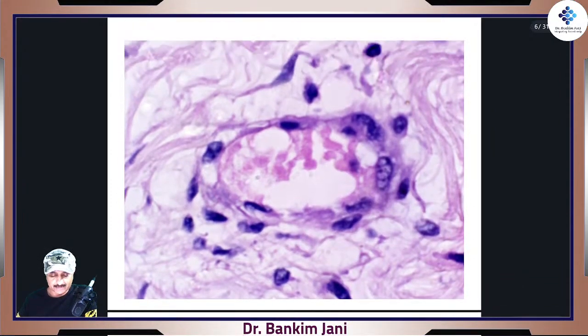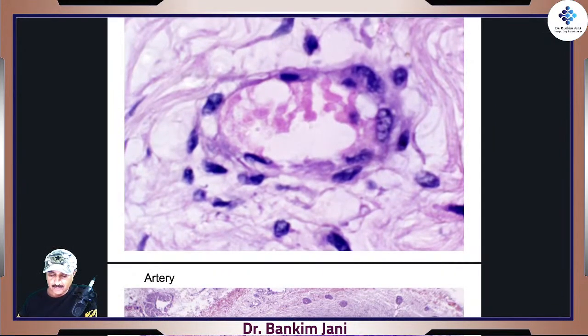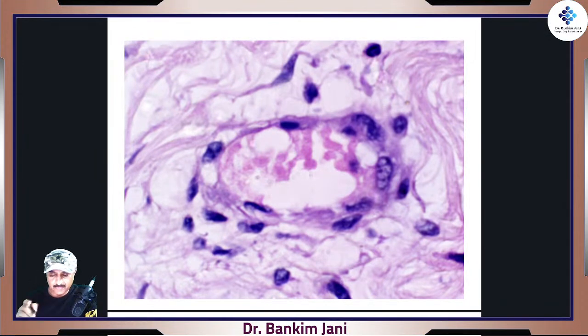This is 100x. Same thing, right? This is 100x. And this is a combination of digital as well as optical magnification. Many times I have gone for digital magnification so that the structure can be seen very clearly. Over here, the entire purpose was only this one particular cell.